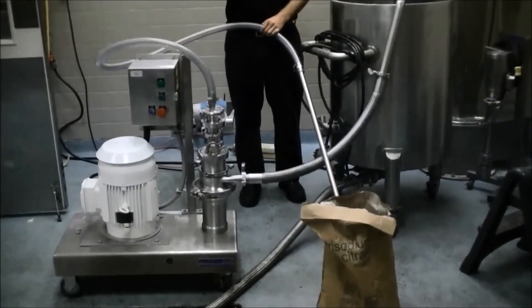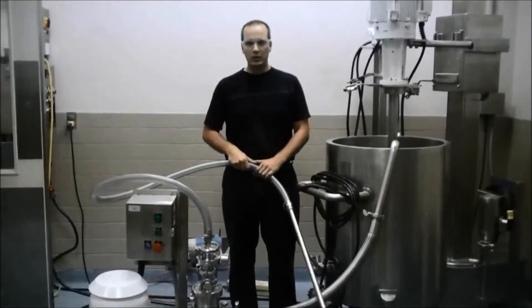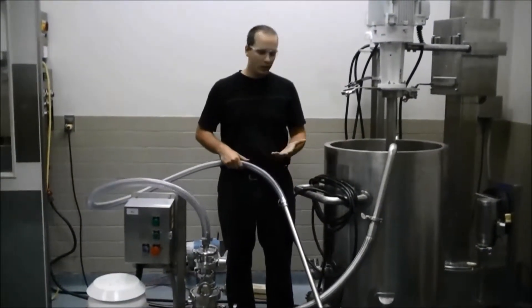We have our bag of sodium citrate in front of us here, and we'll attempt to wand the material in using the wand and the disperser.